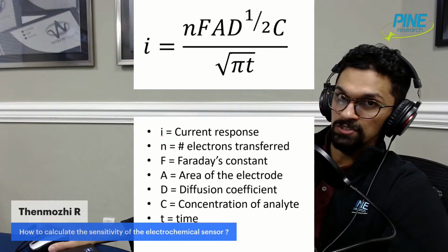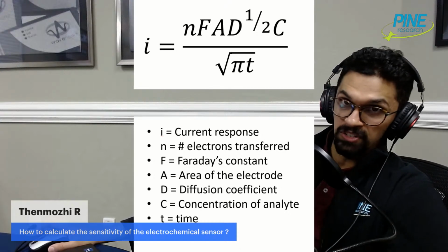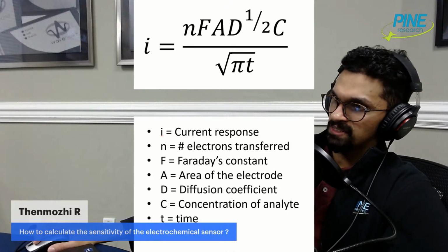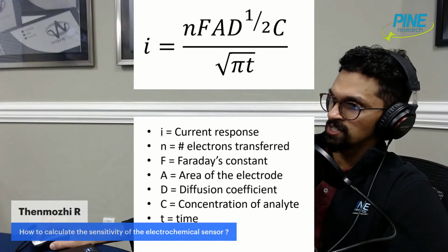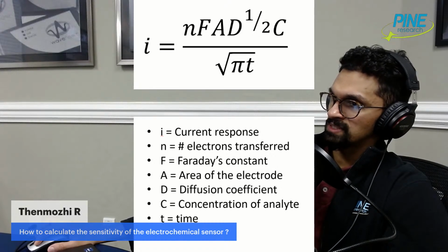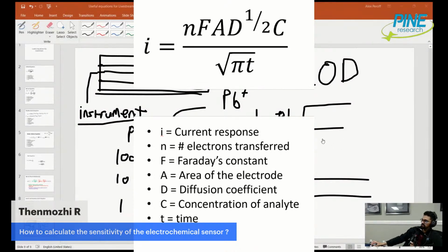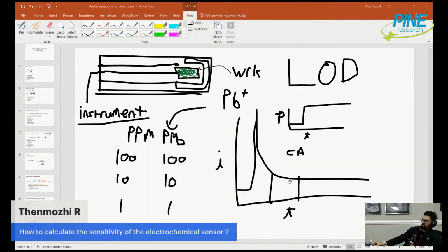And the nice thing is you can actually measure quite a bit of current within a reasonable time frame, because you can integrate the area under this curve. Let me just share my screen again briefly, so you can calculate the area under the curve. Let me hide this for now. So you can calculate the area under the curve relatively quickly, and with some calculations, you can determine the charge. You can also just look at the direct current, and then relate that to a concentration.